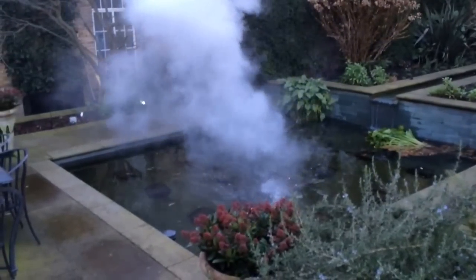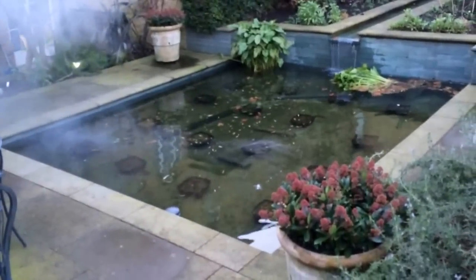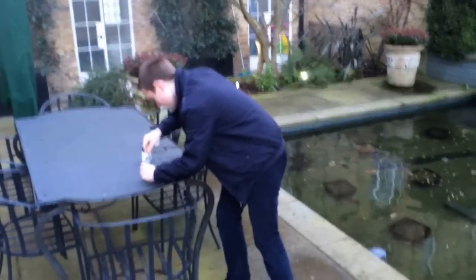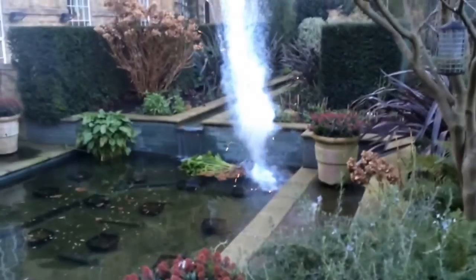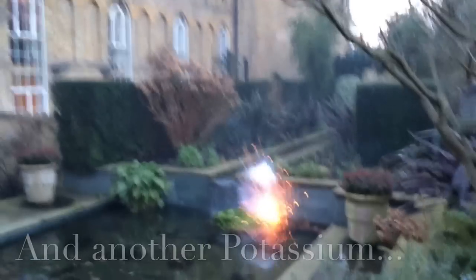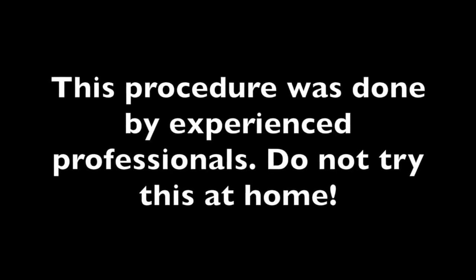We put in another piece of potassium. Yeah, let's just put it in. It's like fireworks. And I think that is enough — you only need a little bit of potassium.